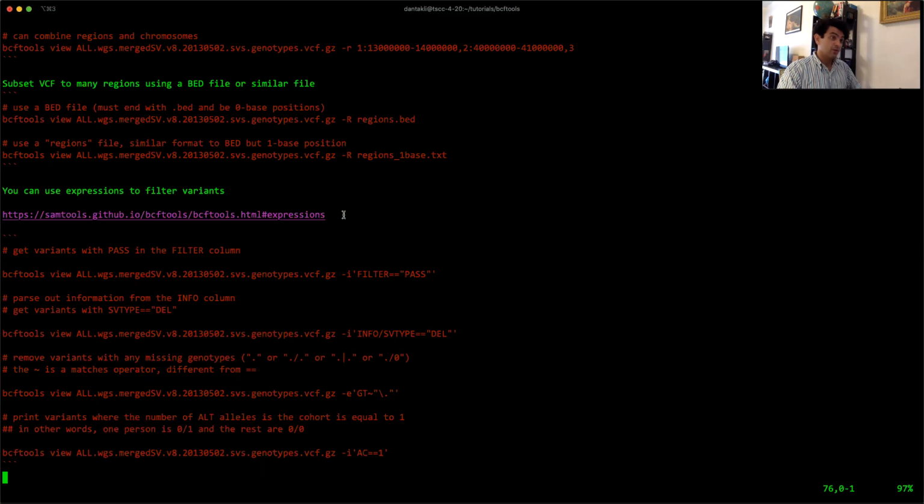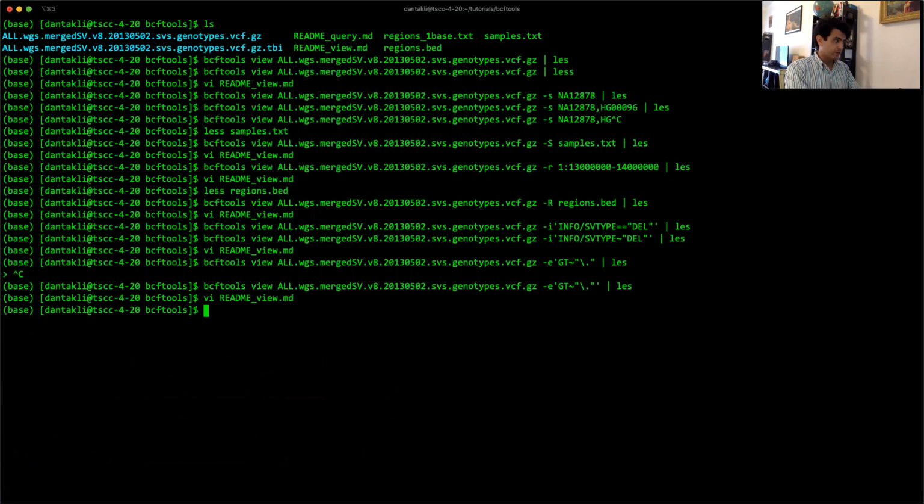It's pretty thorough, and it covers a lot of information, so that instead of writing a script that takes maybe 10, 15, 30 minutes of your time, you can just do a one-liner command, make an output file, and then parse that output file as you need it. Hopefully that makes sense.